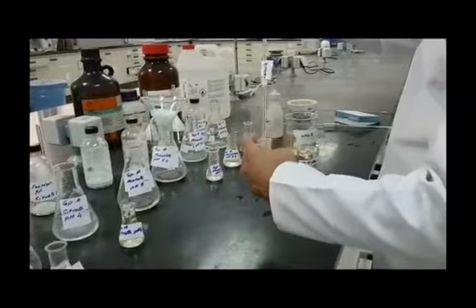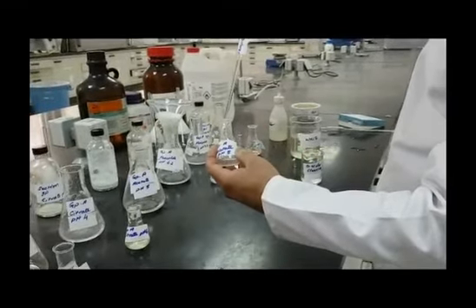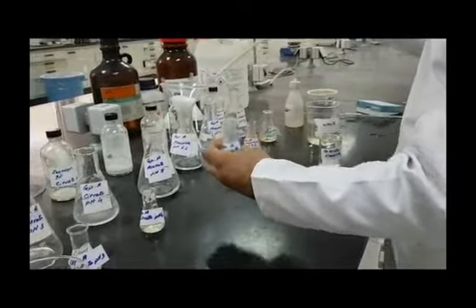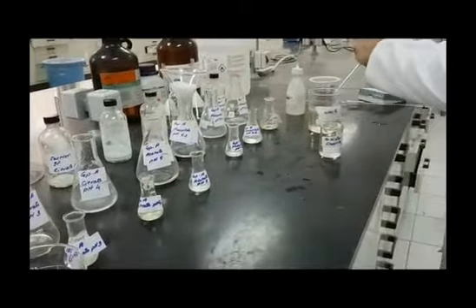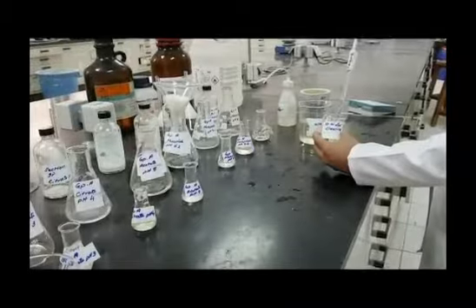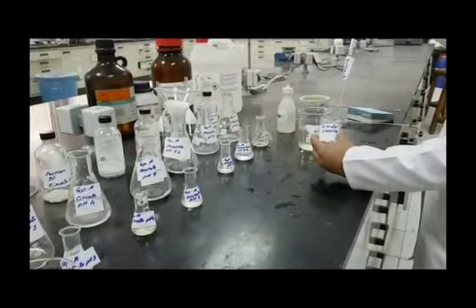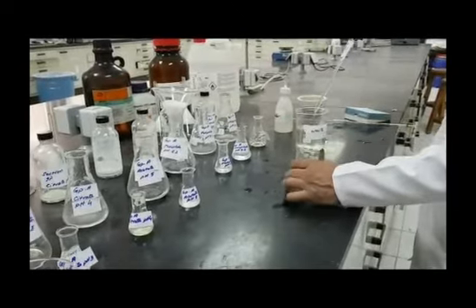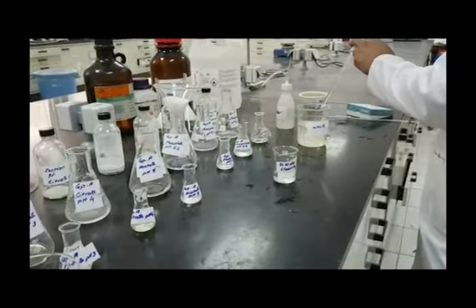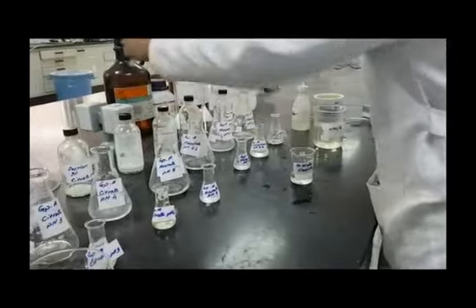If we filtered our samples and then immediately measured their absorbances, we would need to do the blanking or zeroing step each time for each sample, which means 6 times, because each sample would have a different blank, since it is prepared using a different solvent.